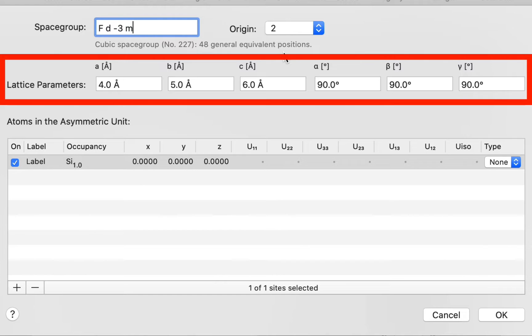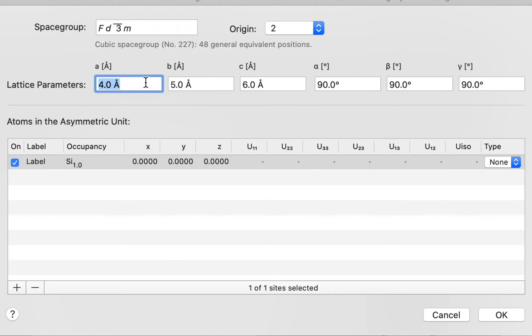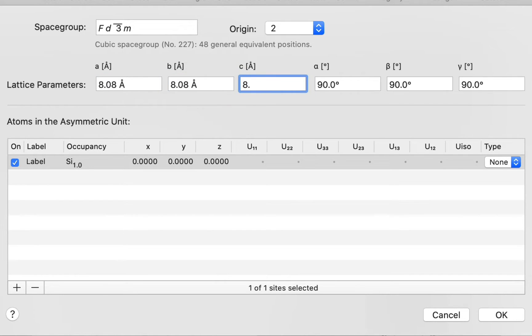Even though we've specified a cubic space group with a cube-shaped unit cell, we need to enter all six lattice parameters just in case you want to make any changes. So I'm going to enter 8.08 as my A, B, and C parameters, and we'll leave alpha, beta, and gamma at 90 degrees.